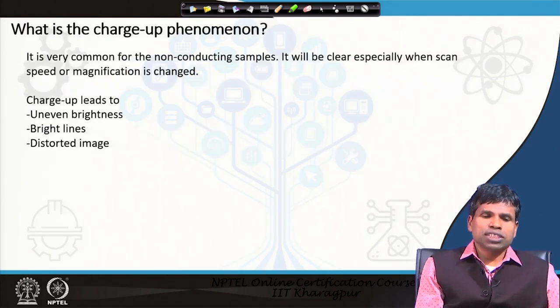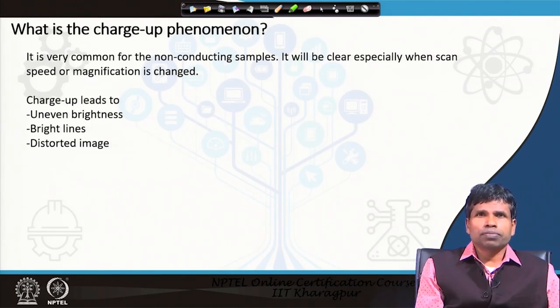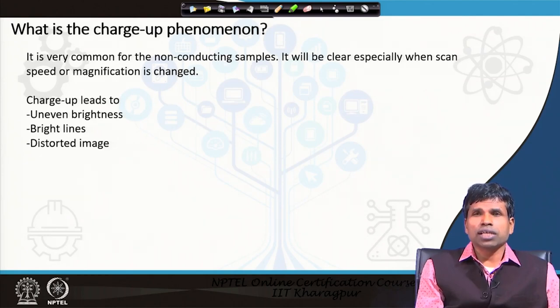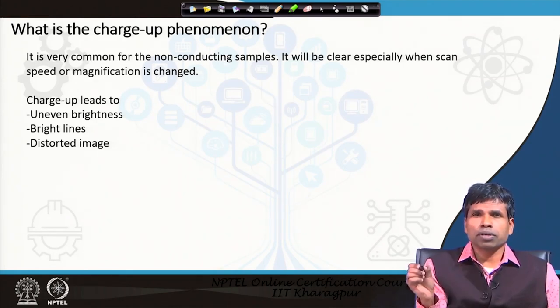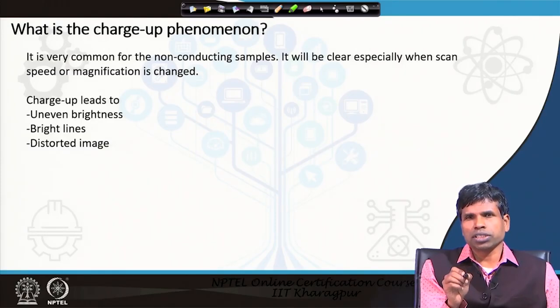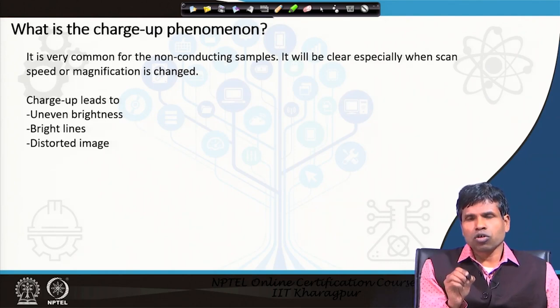Let us first discuss what is the charge-up phenomenon. It is very common for non-conducting samples. It will be clear especially when scan speed and magnification are changed. Scan speed means how fast the electron beam is scanned across the surface — we can decide how long the electron beam stays in one place before moving to another and collecting the signal. We can choose a slower scan rate, which improves the signal-to-noise ratio.